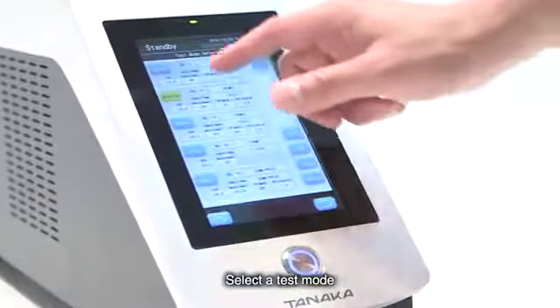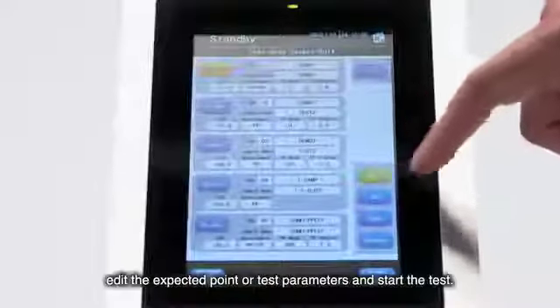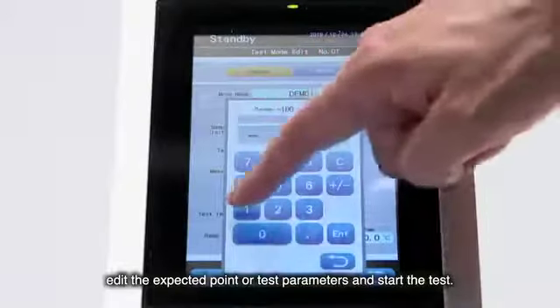Select the test mode and if necessary, edit the expected point or test parameters and start the test.